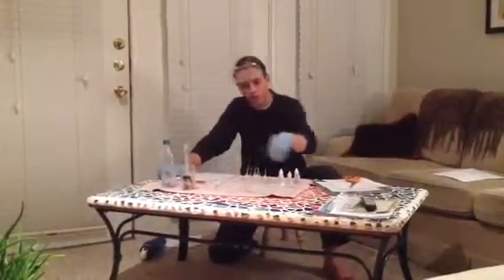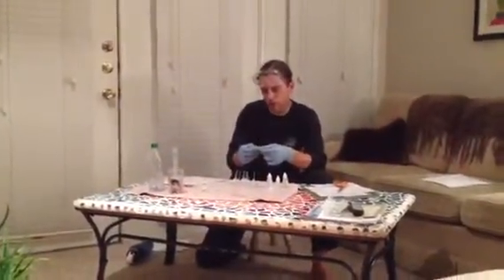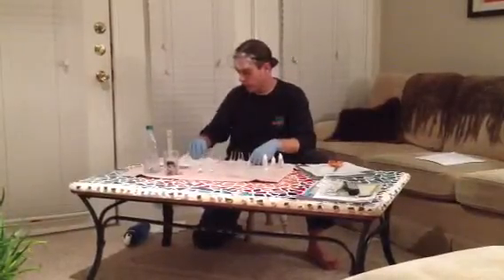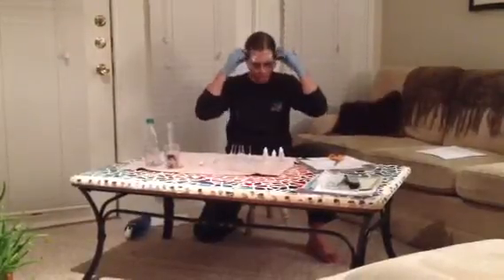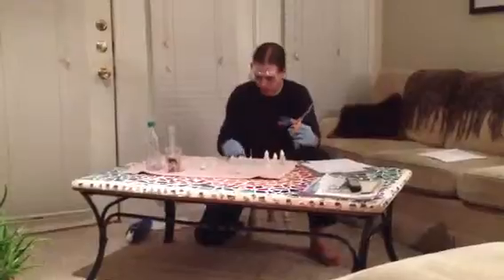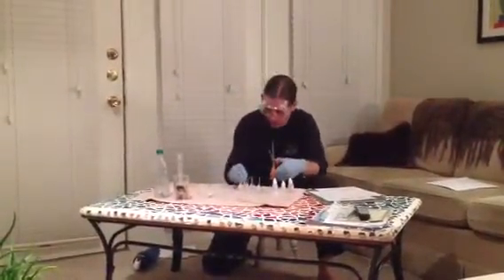I was also told to get some test strips for lead acetate, and we'll go ahead and get started. So, first things first, I'm going to go ahead and open up each one of these containers.